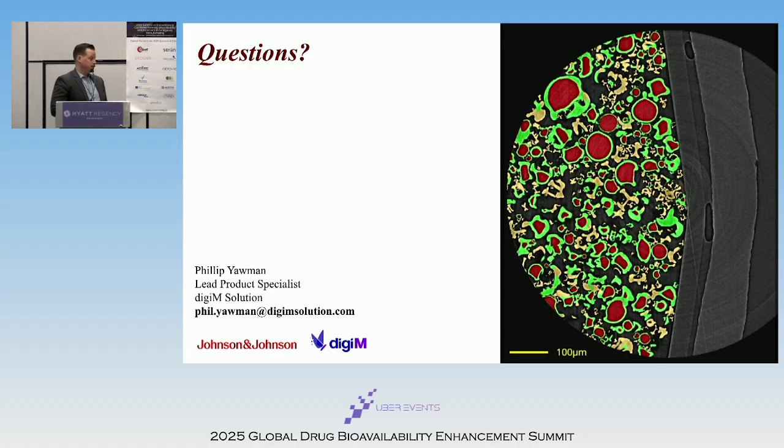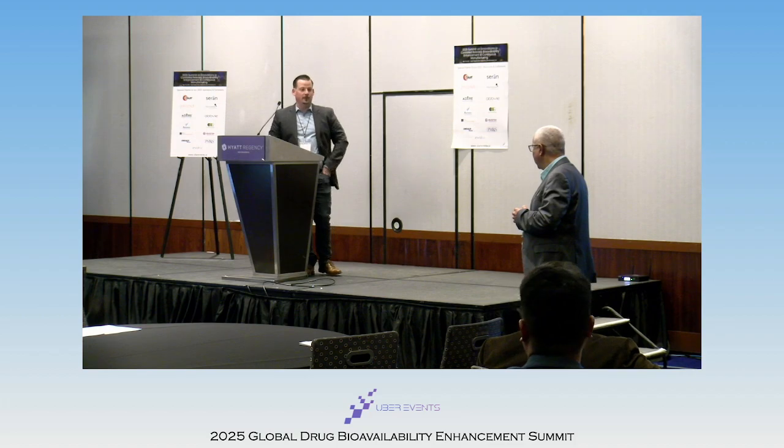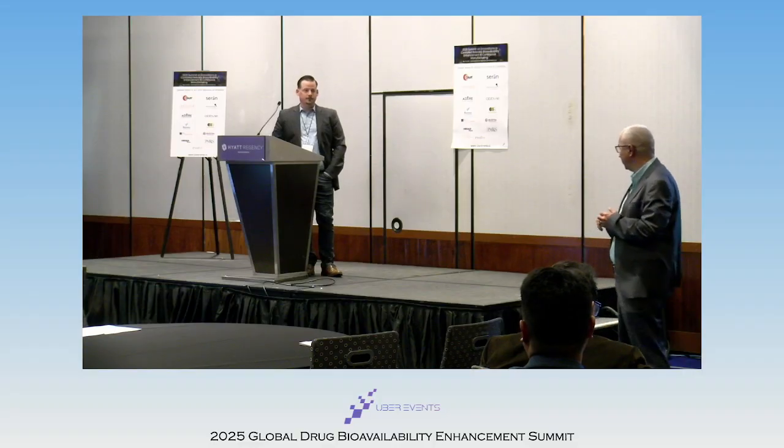Can I see inside a tablet how excipients are distributed? Let's say if I have a disintegrant, tablet to tablet, to see if there is any variation. We did a recent publication with Genentech where we quantified that exact thing. We took one of those mosaic field of view images that I showed, and we were able to segment out the croscarmellose sodium, get a distribution of it, and then correlate it with some of the disintegration. Okay, so maybe I need that publication.